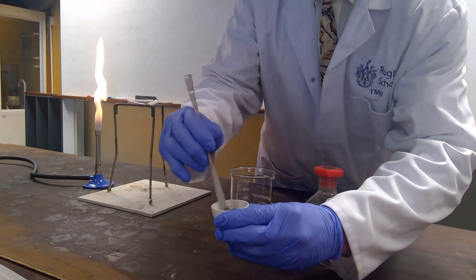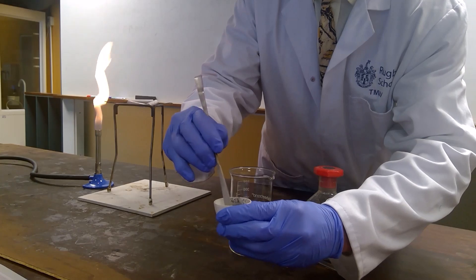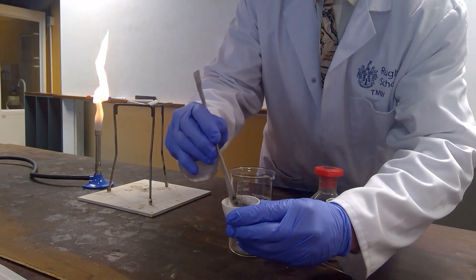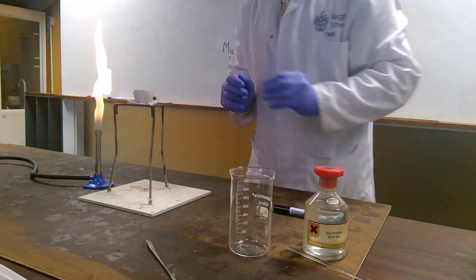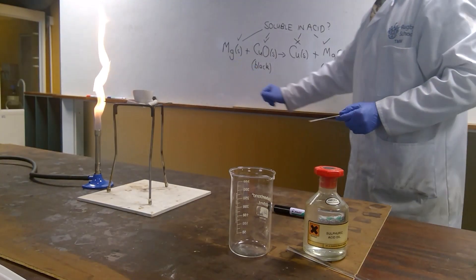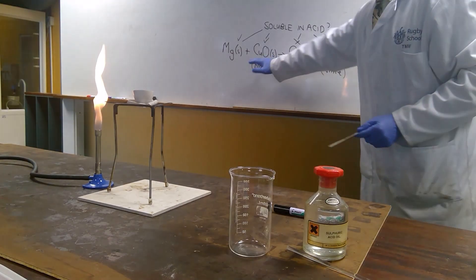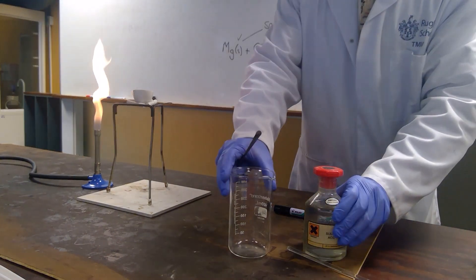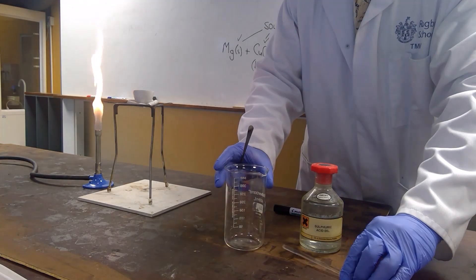To show that there is a displacement reaction, at the end of the reaction I am going to take the contents of the reaction and put them into sulphuric acid. The sulphuric acid is capable of dissolving the magnesium, the copper oxide, and the magnesium oxide — the reactants and the potential products. This means that in the sulphuric acid, some copper will be left at the end. So at the end of the experiment, I am going to collect the solid that is left and place it into the sulphuric acid.